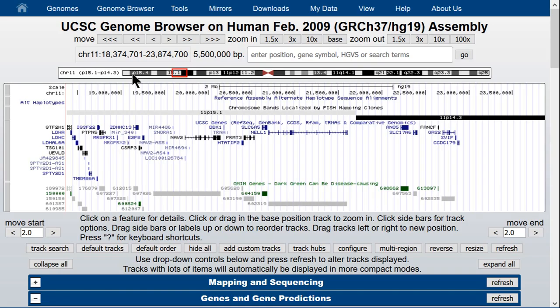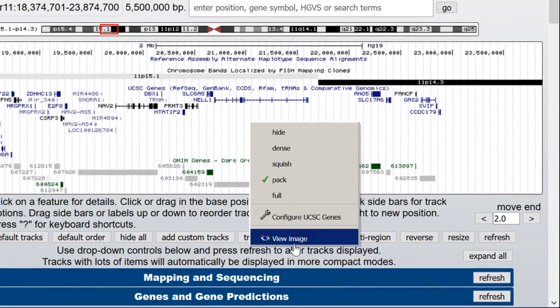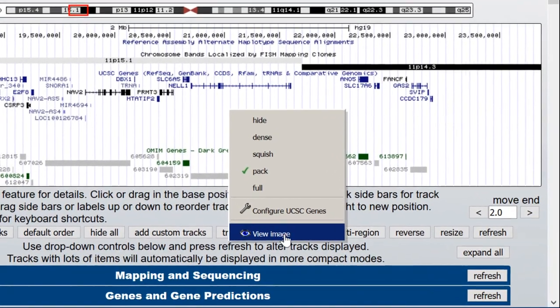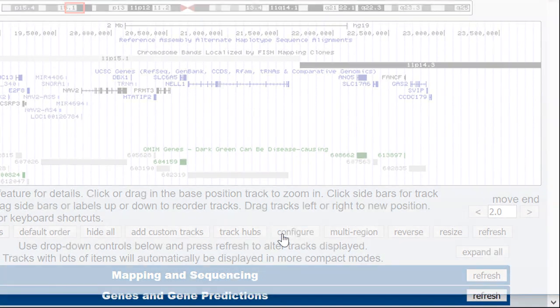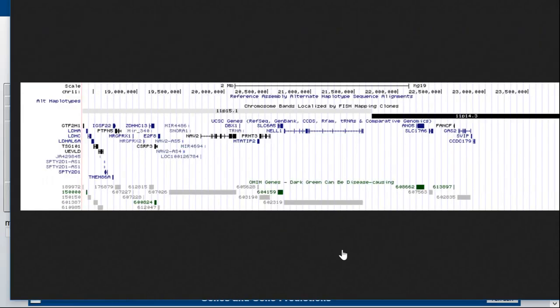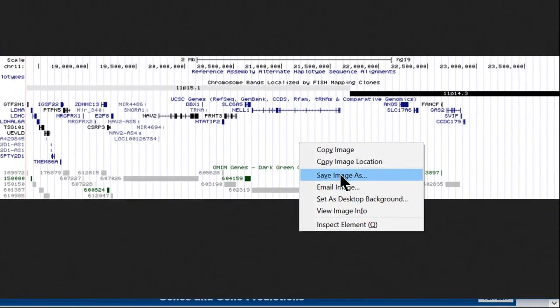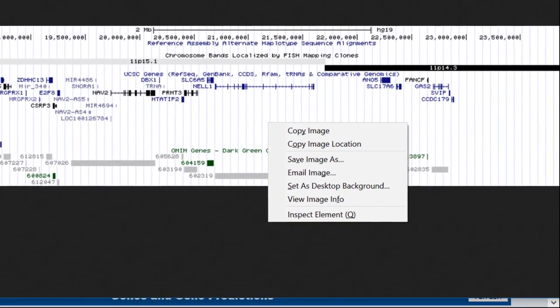It is possible to export an image from the browser in a number of ways. If we use the right mouse button to view the image, it will draw the browser image from the middle of the screen, and then you can save the image to a directory as a PNG file. The PNG image will get pixelated if you try to zoom in, and is only at screen resolution.